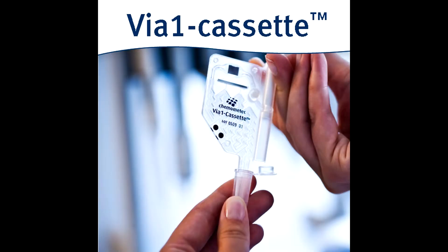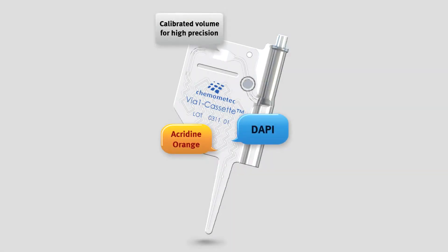The calibrated VIA1 cassette contains Acridine Orange, which stains all cells, and DAPI, which stains non-viable cells. No additional reagents are necessary.